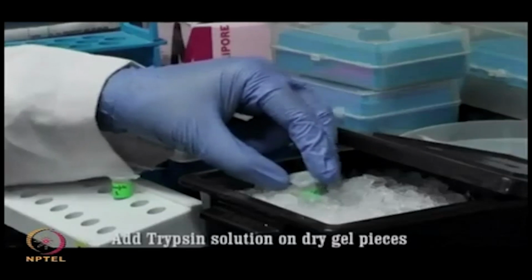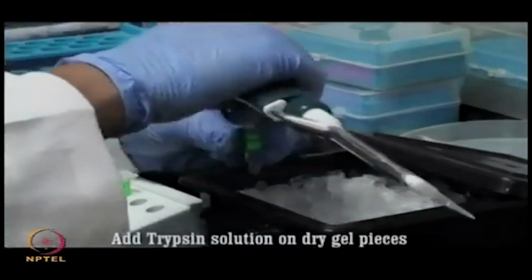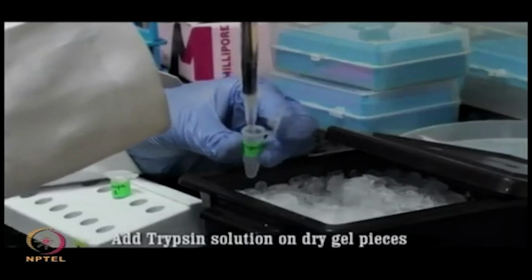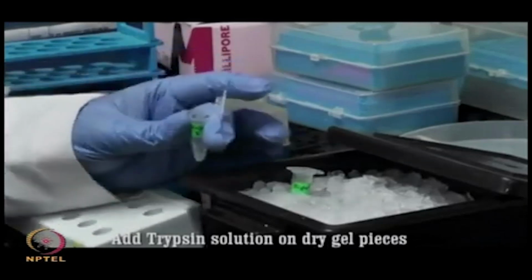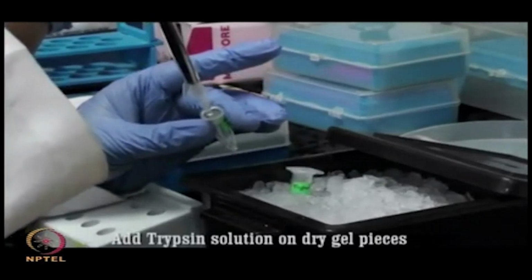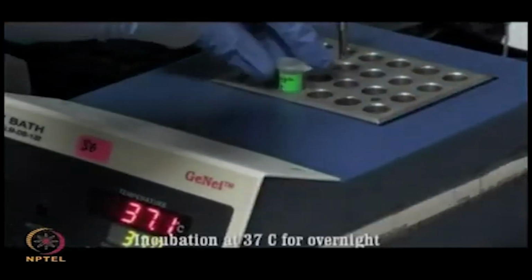Air dry the gel pieces and then add 25 microliter of trypsin solution, around 500 nanogram. Add trypsin to the dry gel pieces and keep it on ice for 30 minutes for absorption of enzyme by the gel pieces.